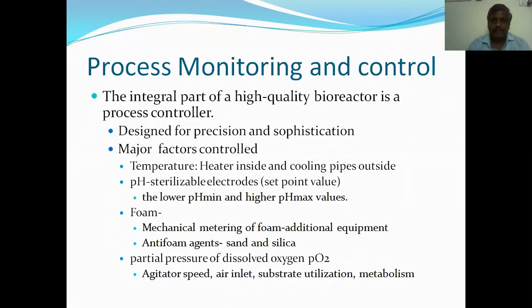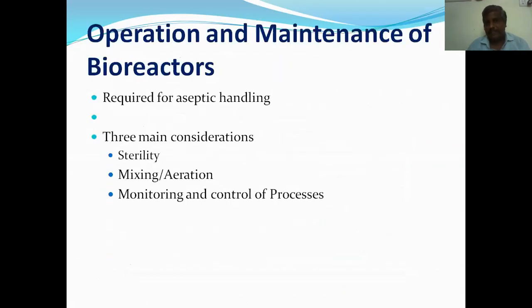So I would like to conclude that the operation and maintenance of bioreactor has three main considerations. Number one is sterility. Number two is mixing and aeration. Number three is monitoring and control of processes.